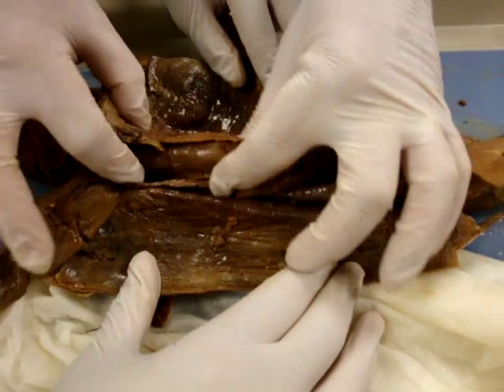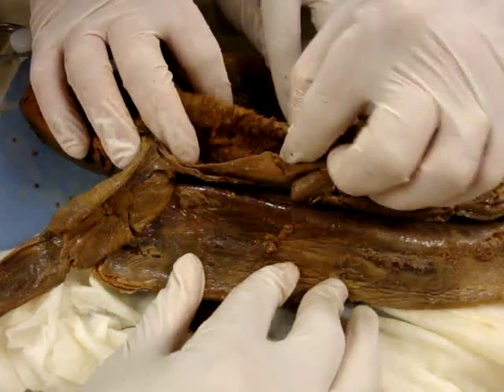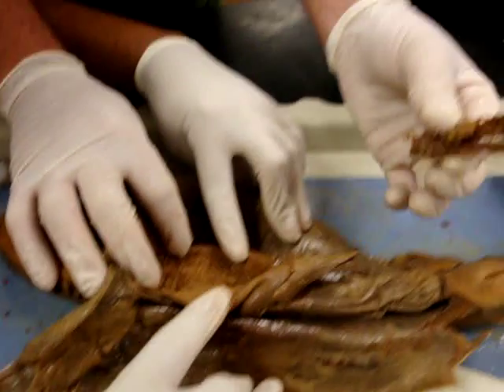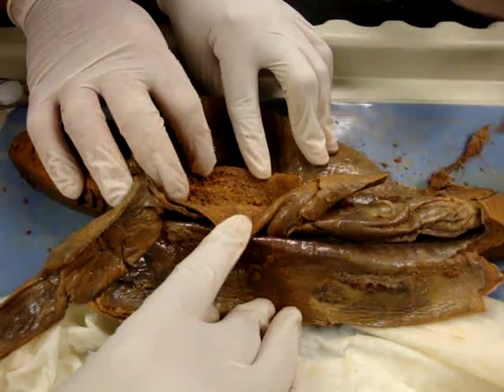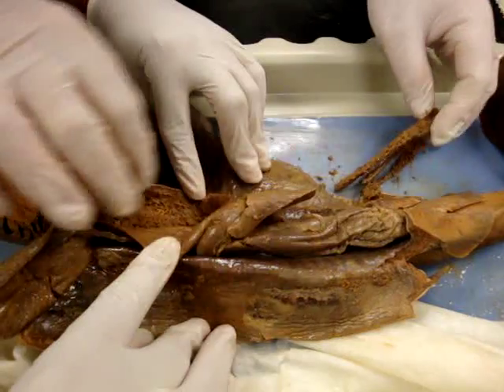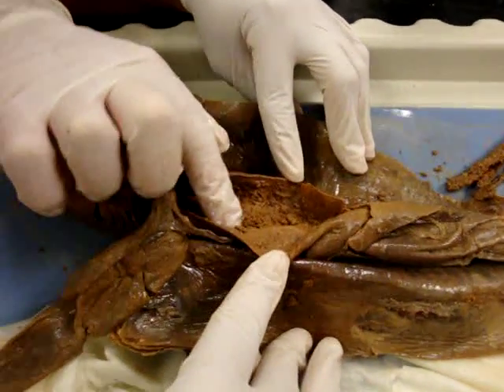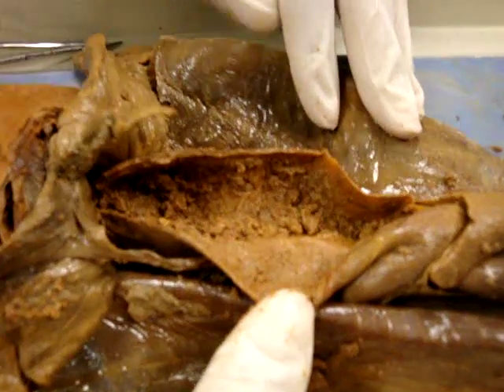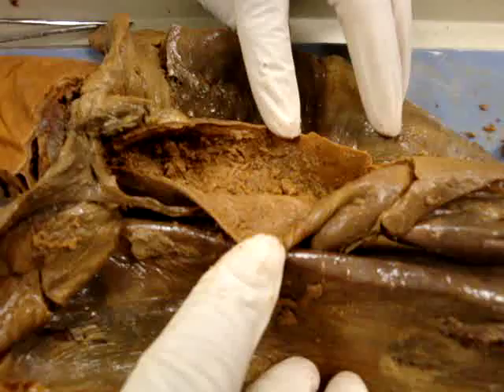Here we have the stomach — a big, expandable stomach. We opened the stomach up and found some stuff inside. In fact, that is another little fish; you can see there are fins here, and this is probably a cranium right here, and a vertebral column right here. Also inside the stomach, you see little wrinkles called rugae. They allow the stomach to stretch and also allow an increase in surface area when the stomach isn't completely full.